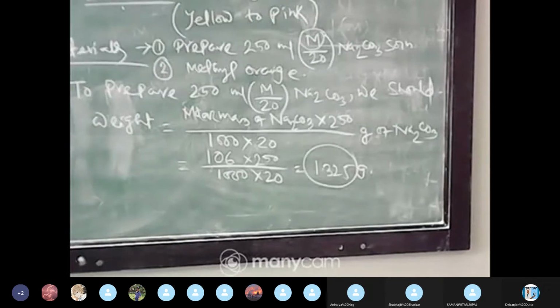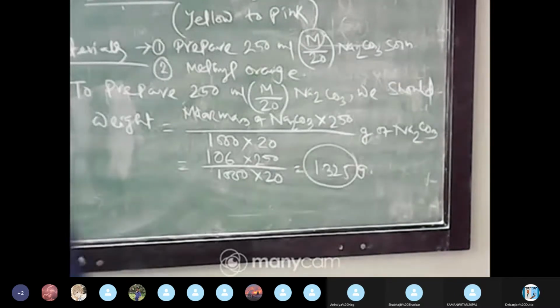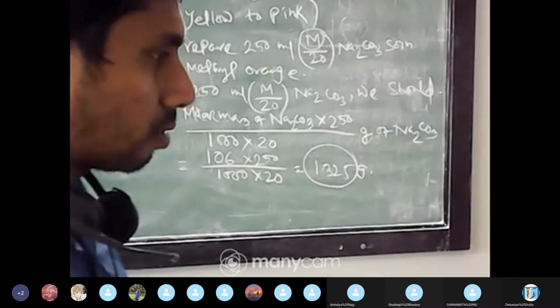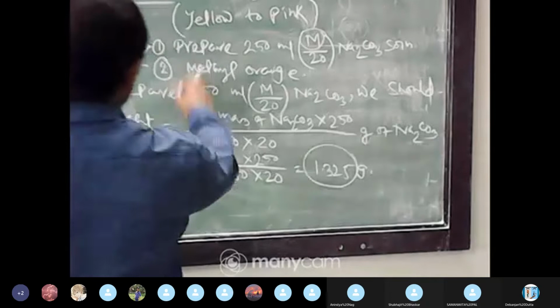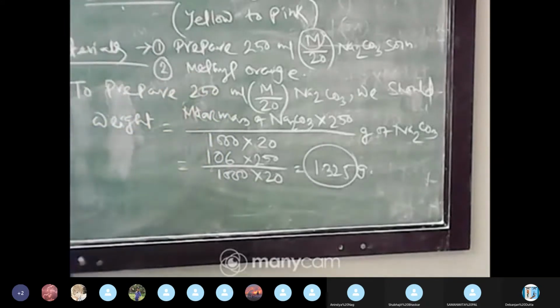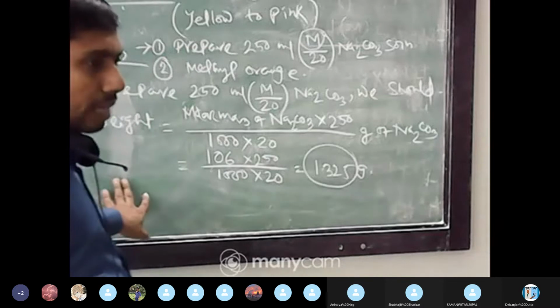Norin is asking about the rest. The rest means the materials. You have to add some extra points. I have mentioned only 2 materials, but you have to add the pipette, burette, etc. Then the procedure will come.